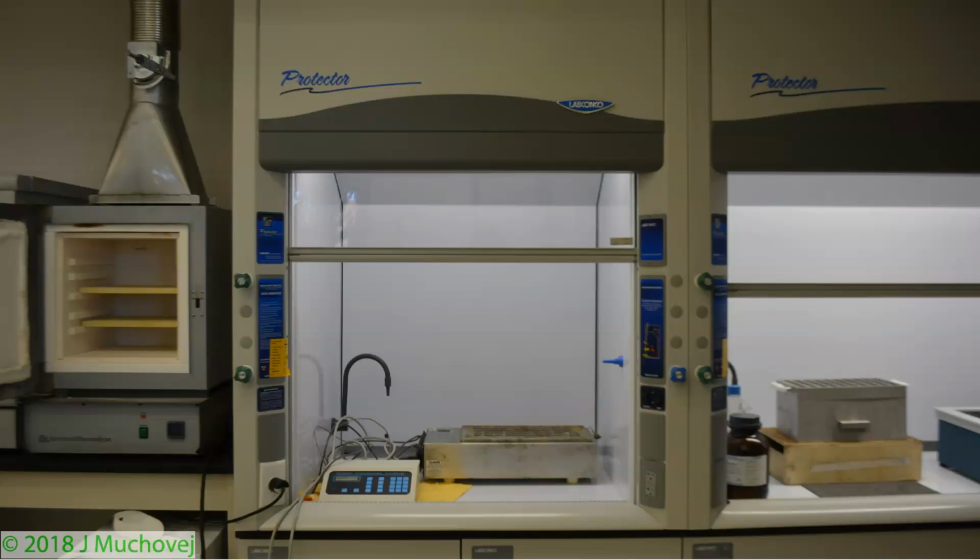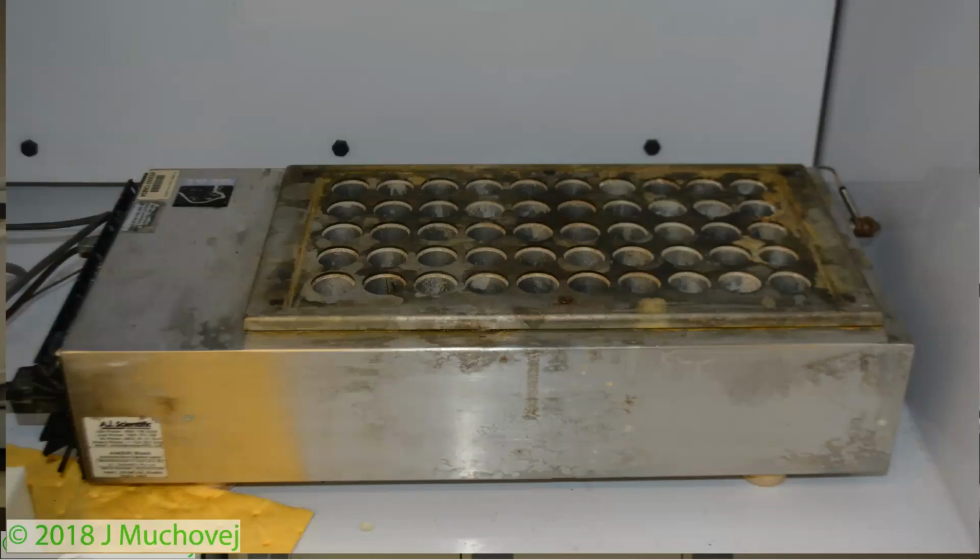Wet ashing. We start out in a fume hood that's going to use acid. It is going to generate some really caustic vapors. We want to be very careful about this. We have a heating block. The heating block is going to heat these to a boiling point. You're going to have the tubes hold the sample on the inside. It's going to boil in that acid. It is going to only retain the mineral portion.